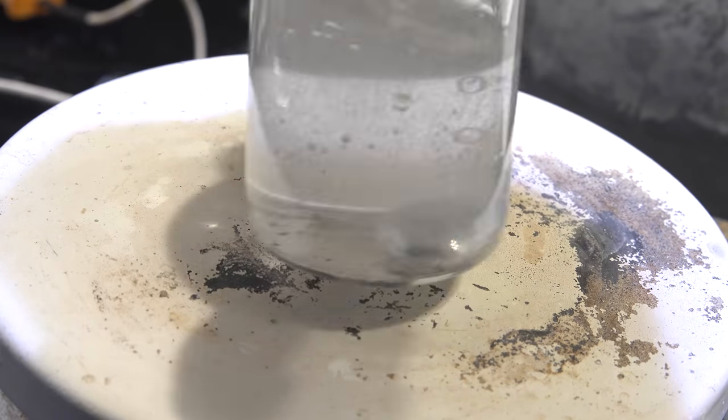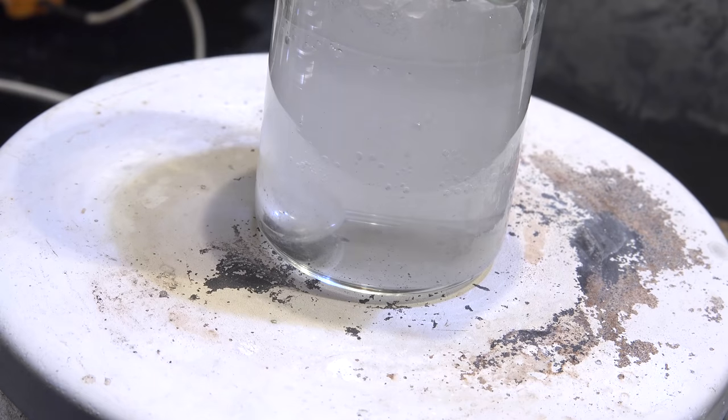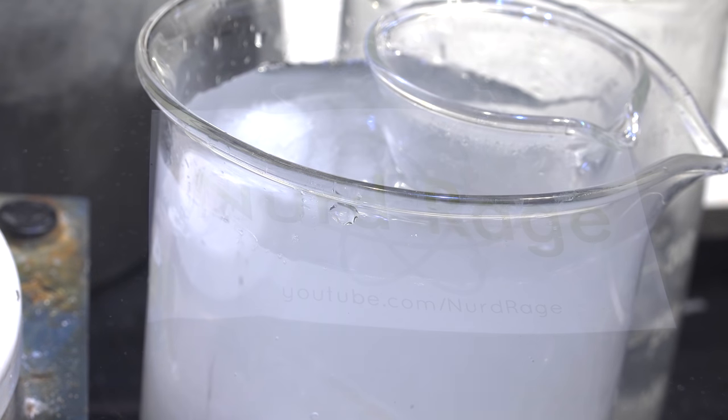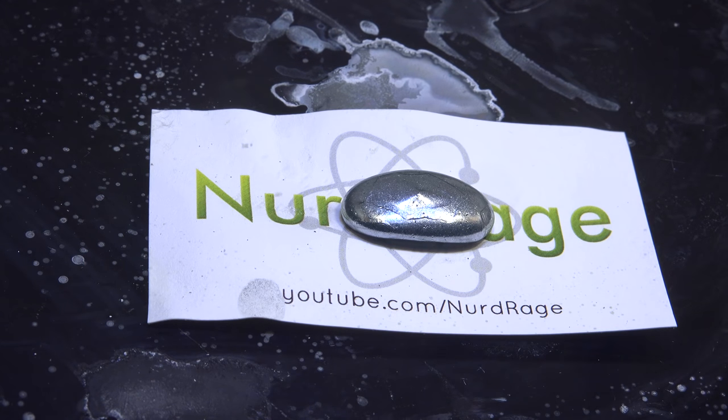Anyway, once the gallium is completely molten, shake it a few times to knock off the impurities. Once that's cleaned, quickly dunk the container in ice water to cool it and re-solidify the gallium. Once it's solid, pull it out and give it a wash. And there we have it — a hunk of gallium metal recovered from gallium aluminum alloy.